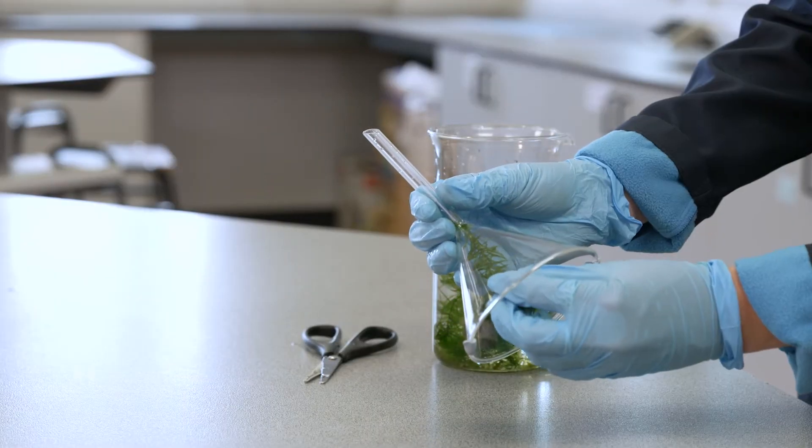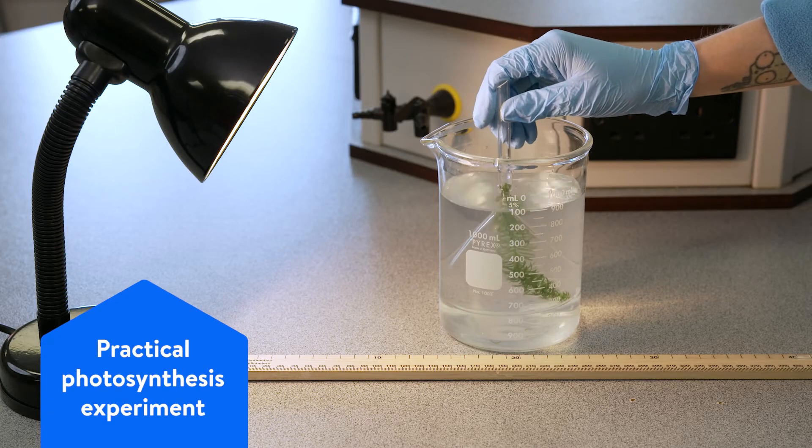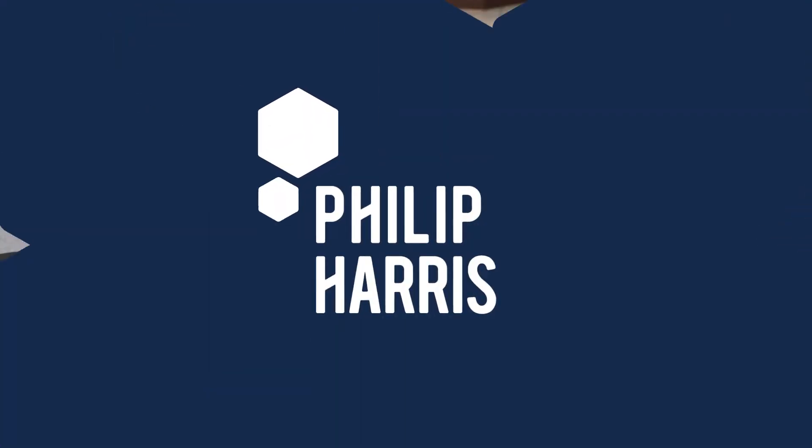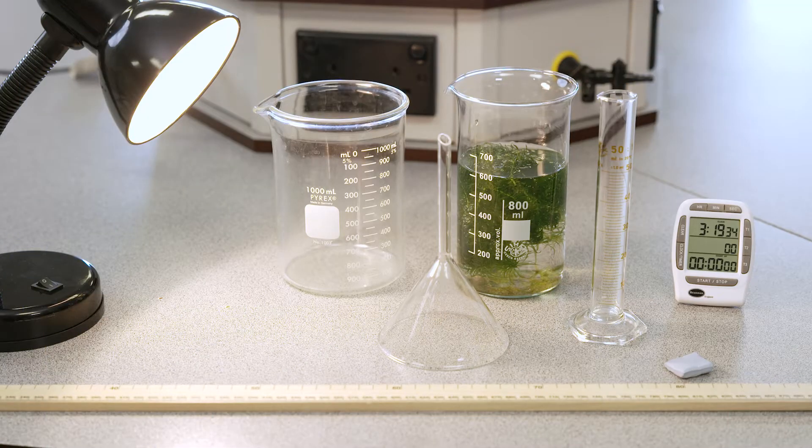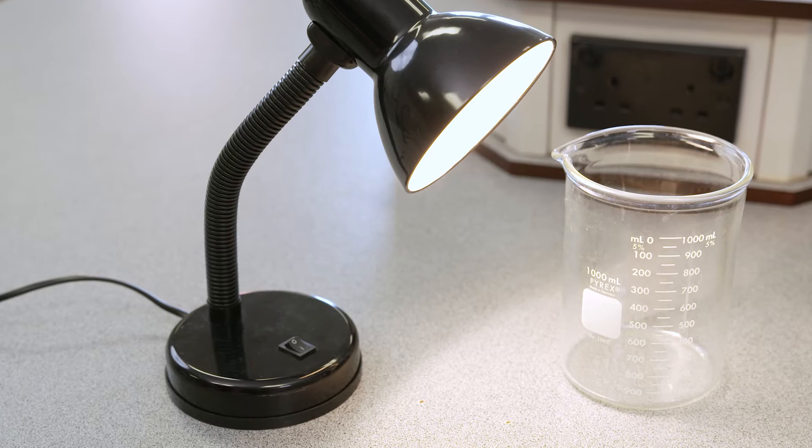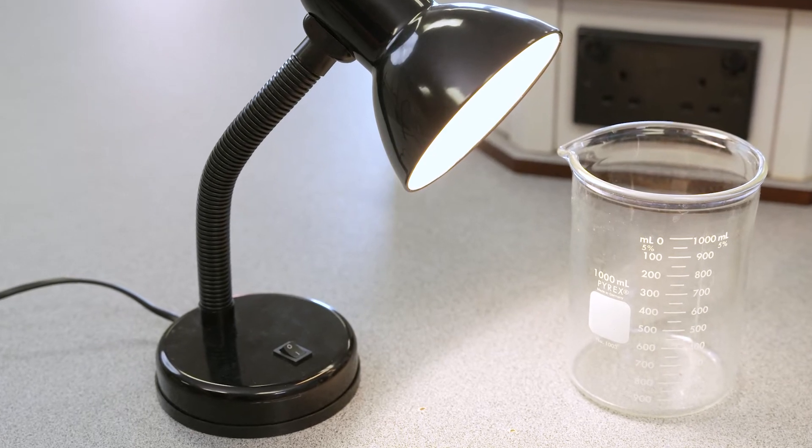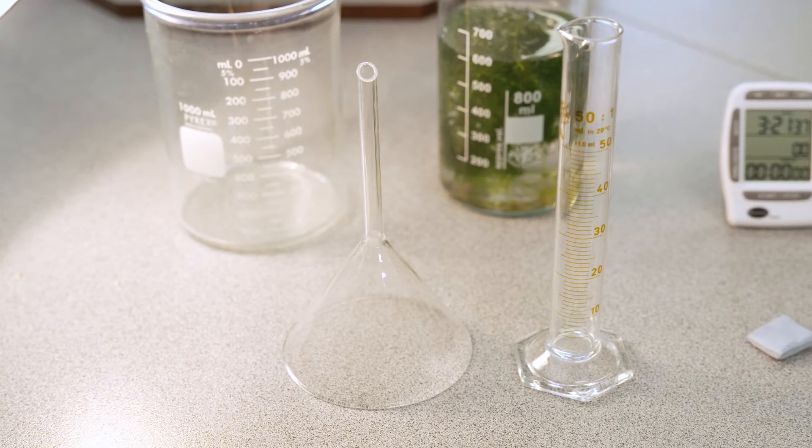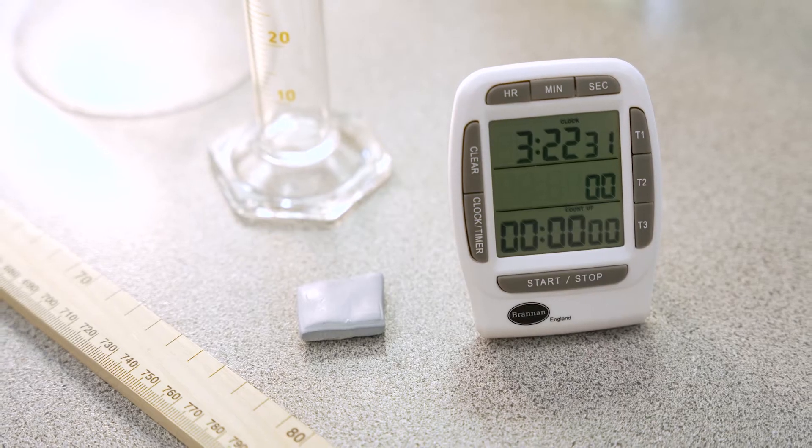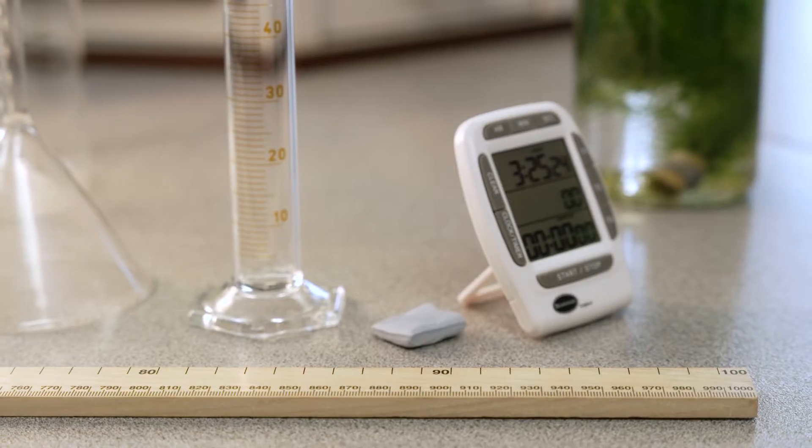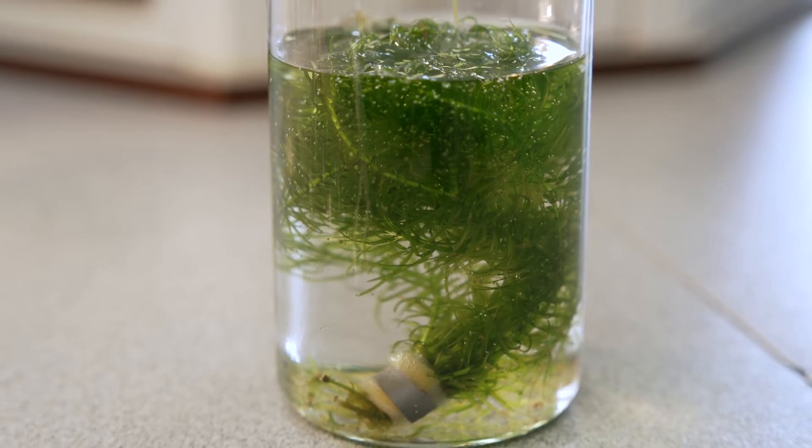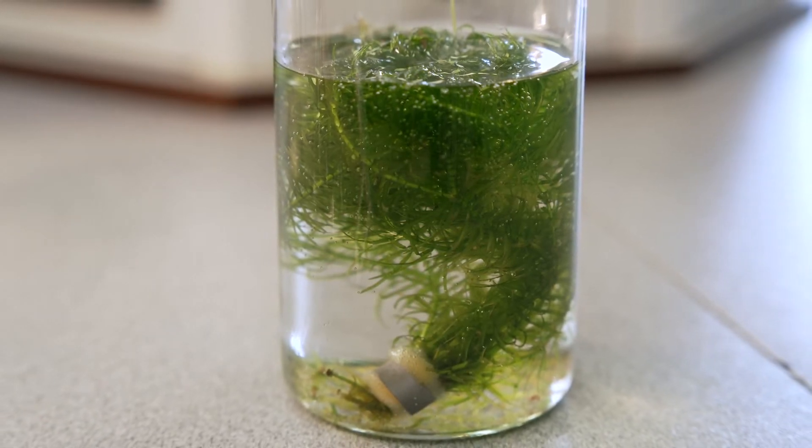Welcome to our video showing you a practical photosynthesis experiment. To carry out this experiment you'll need a light source such as a desk lamp, a beaker of water, a filter funnel, a measuring cylinder, a stopwatch and blue tack, a one meter ruler, and a 10 centimeter piece of pond weed which you can get from most aquatic stores.